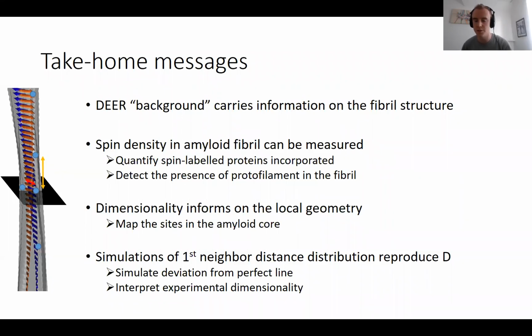Okay, thank you. More questions? Hi, Yann. I have a question. Hi. Is it possible that the dimension 1.5 is a result of the protofilament? Yeah, that's a really good point, and that's something I haven't shown. We're simulating that to see how having those protofilaments changes the dimensionality. It's possible, yes. In principle it can have an effect on D.